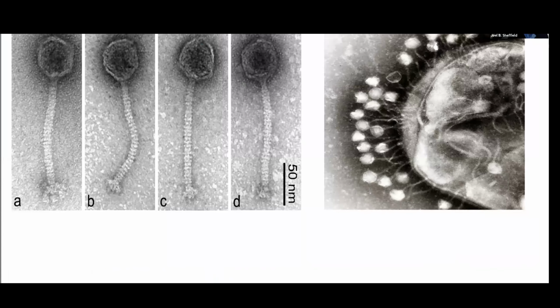And here's just another couple of pictures to show you as things get improved both in technique and in microscopy, we start to really see the kinds of detail that become available through this process of negative staining. And I had to include this picture, which is bacteriophage, all bound to a bacterium. So it's the sort of thing that is worth 1,000 words. It's a very dramatic way of imagining what a bacteriophage attack on bacteria might be.